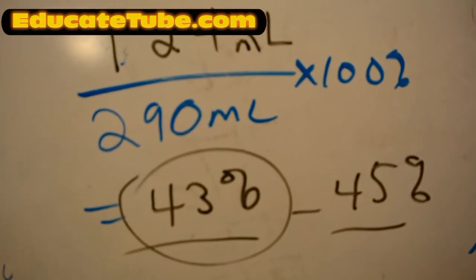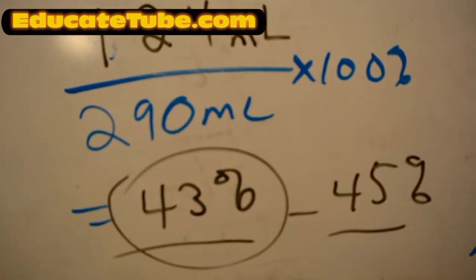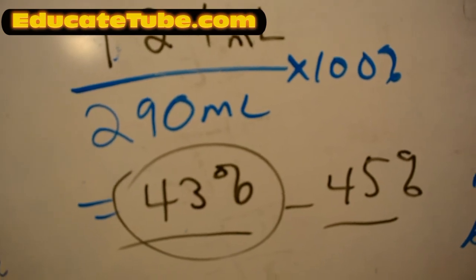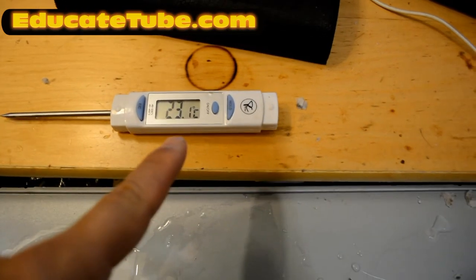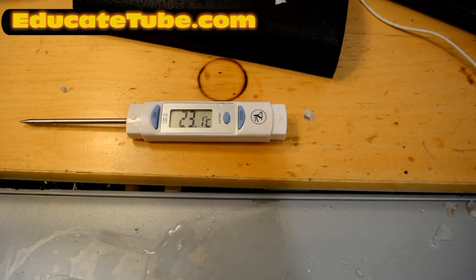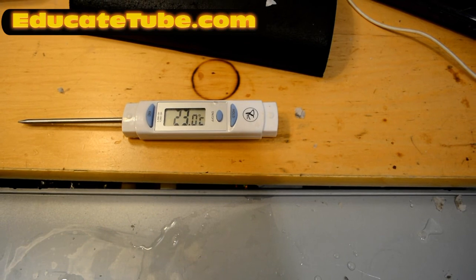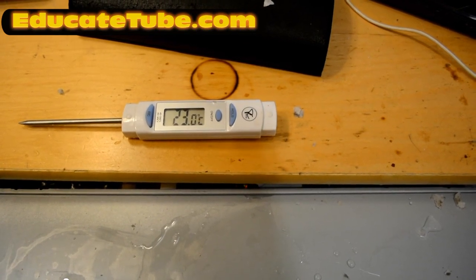Around 125 milliliter is the gas produced. The temperature of this experiment is 23.1 Celsius. Okay, so since it's a gas experiment, we have to make sure we know the temperature. So it's around 23.1. Alright.